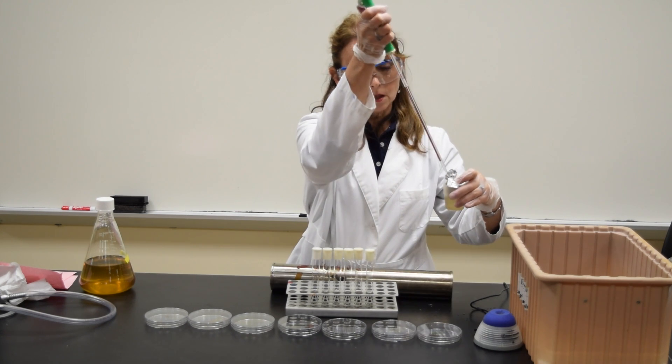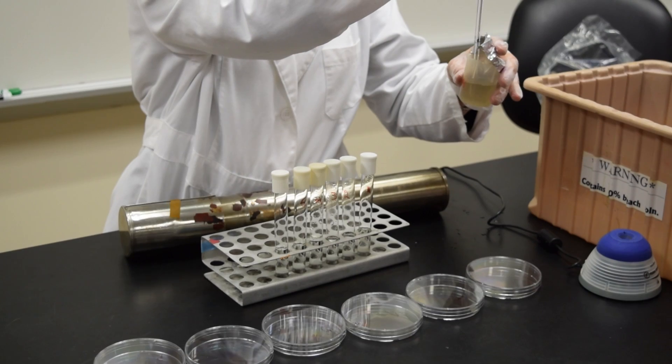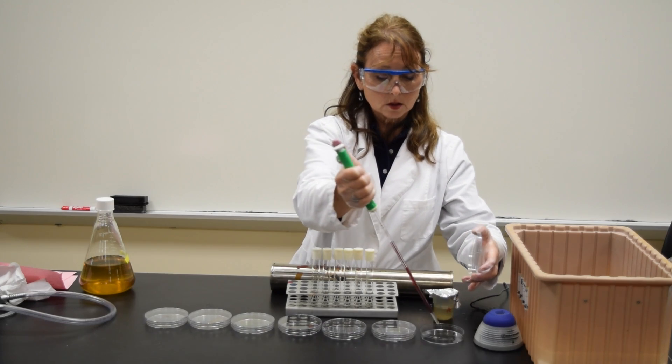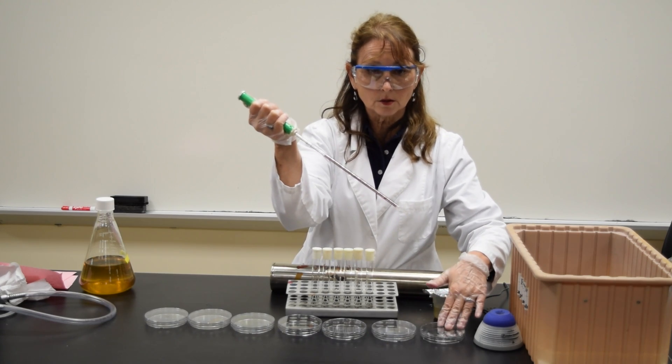I'm going to go into this beaker, draw up to the 1.0 mark, and add 1.0 mls to the plate that's labeled 10 to the 0.